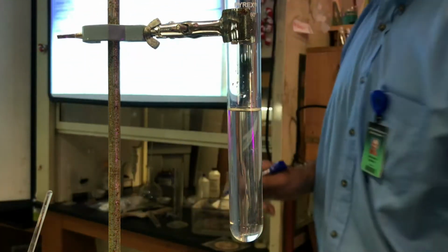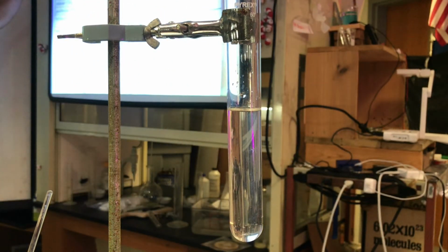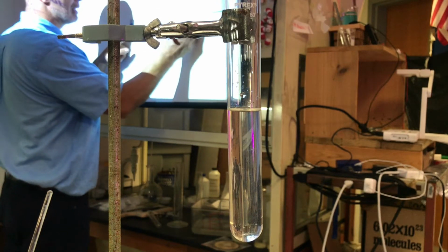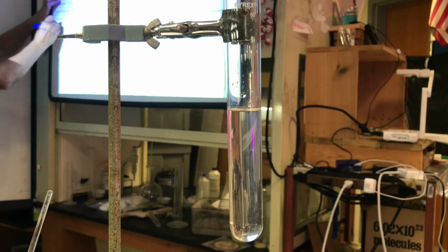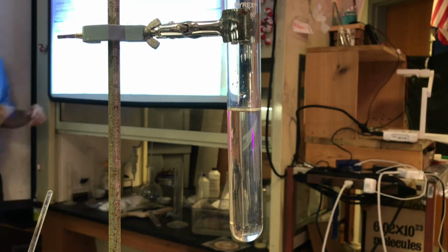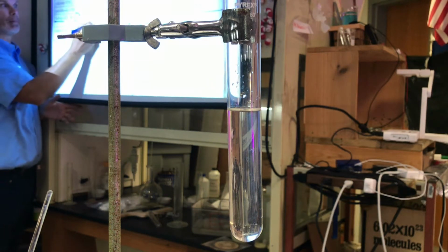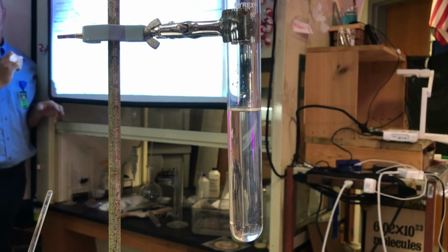Potassium is a group 1 ion, always soluble. So it breaks apart into K+ and I-. I- is a halide. Remember halogens? Remember from our summer? Halogens are group 17. They're all -1, so iodide is normally soluble. Look at the exception though. With lead, it's not soluble.